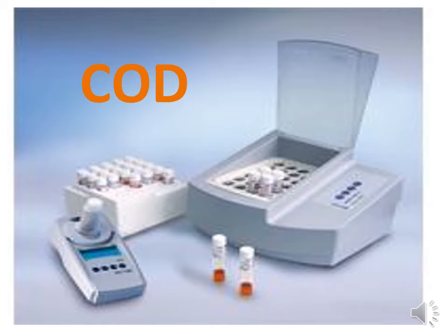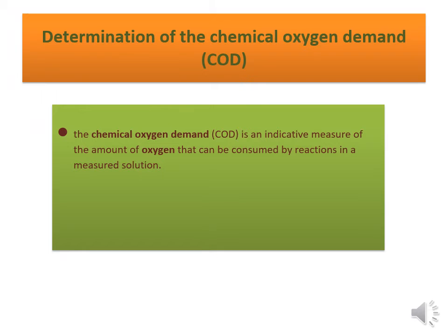Bismillahirrahmanirrahim. I am Huria Absaf from the Chemistry Department, and I am going to discuss COD, which is the abbreviated form of chemical oxygen demand. So what is basically COD and how do we determine it?